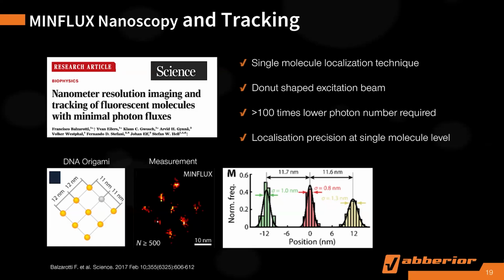If you do a fitting, you see the deviation is around 1 nanometer, right? The first group of bullet holes, deviation is 1 nanometer. Second group, 0.8 nanometer. Third one is 1.3 nanometer. That's the localization precision, okay? That's actually the resolution we normally quote in localization microscopy. Actually, there's a factor of 2.3 relative to the normal full width at half maximum concept as we learned from other microscopy.